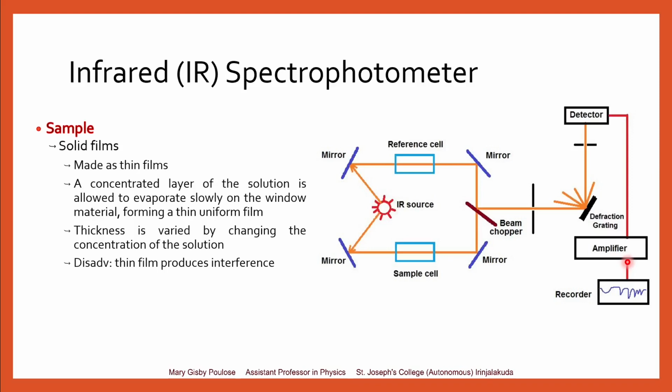Now, these were the different components of the infrared spectrophotometer and the different forms in which we take the samples in it. That's all for today's session.